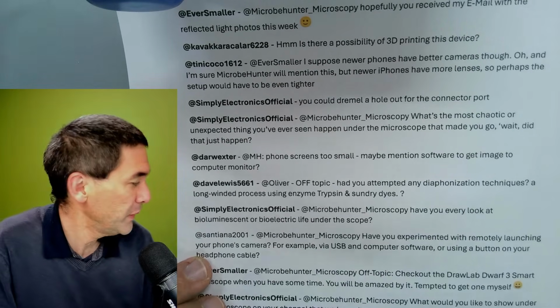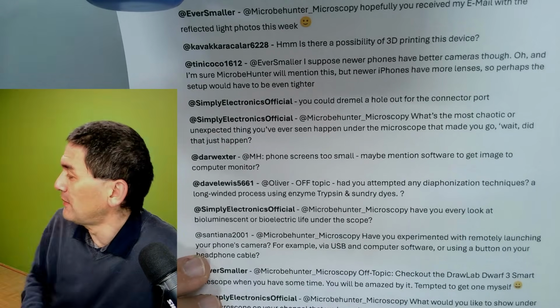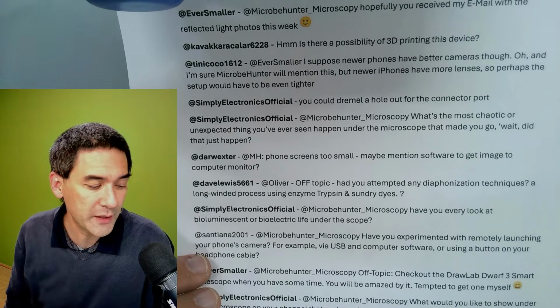Yeah. By the way, I just want to show you something else. It just came into my mind. Something that I have tried out. Just a second.